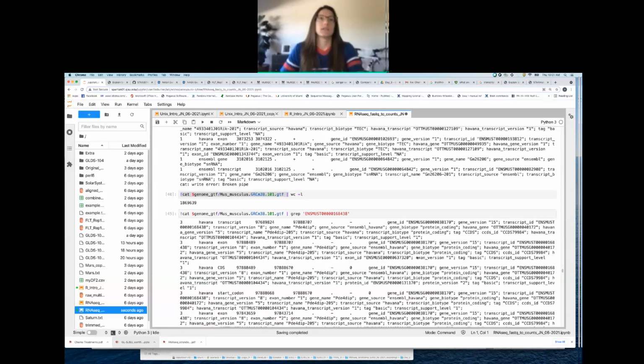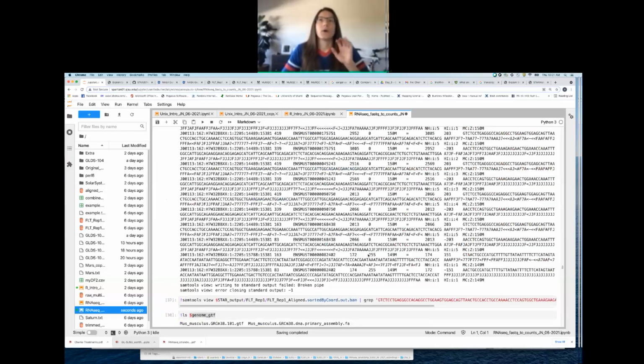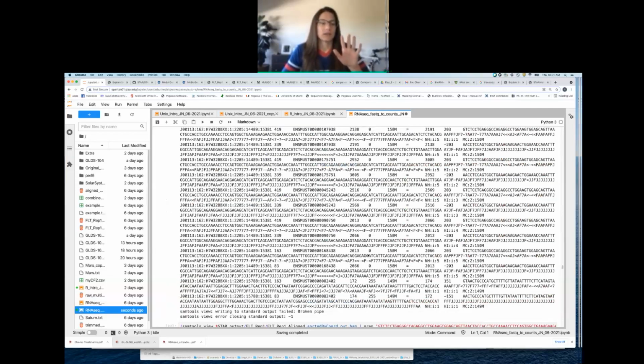And indeed, Felix, your hypothesis was absolutely right. All 5 of those transcripts are splice isoforms of each other, all derived from the same gene, 381, that ends in 38170 in terms of the Ensembl ID. So yeah, great hypothesis, and it was right. Questions about what we just did and why we did it?